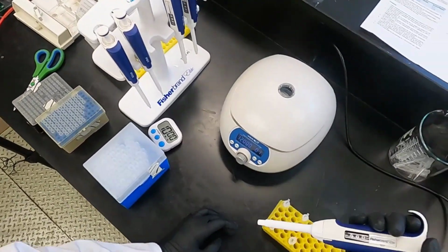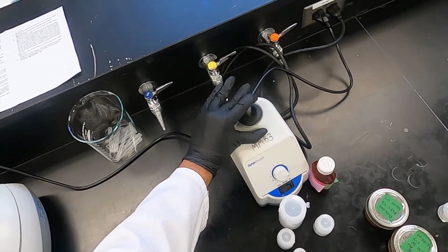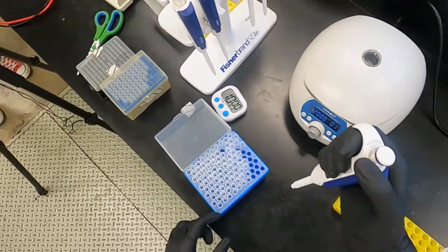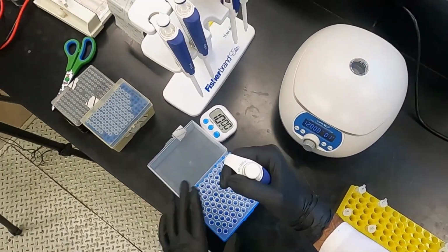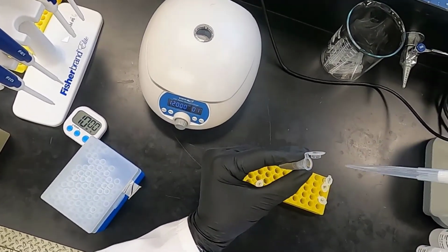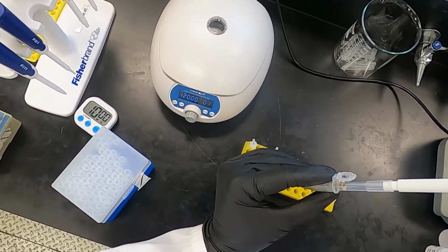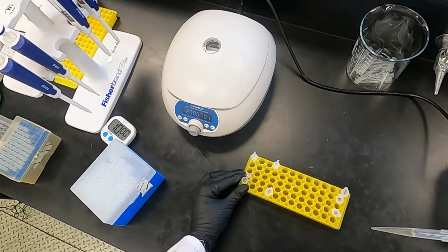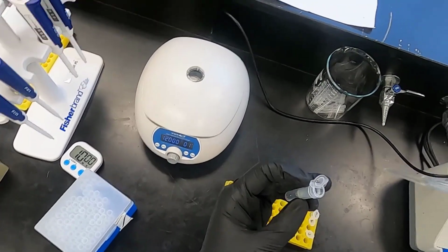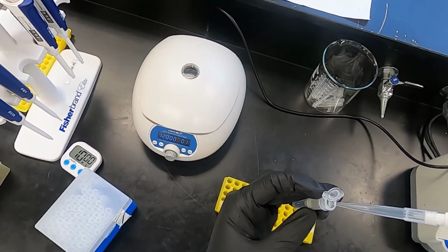So we're going to take 500 microliters of our sample, and we're going to transfer it to the capacity, as much as we can. So we're going to vortex it, make sure everything is mixed, and make sure any precipitated DNA is going to be added to the columns. The capacity of these columns are 500 microliters, so any extra will be done in the next step. We're going to repeat the same step over to make sure everything is collected. So load this up to 500 microliters.